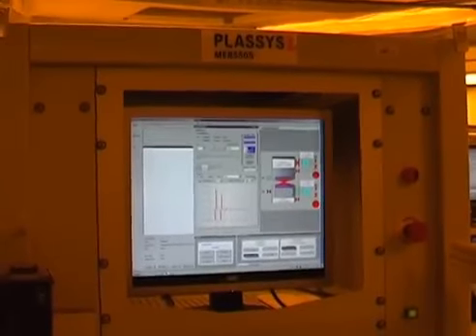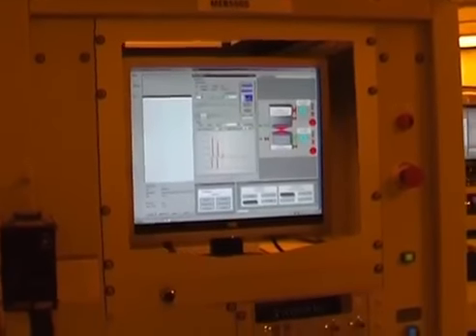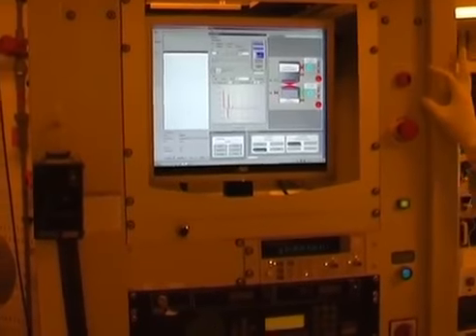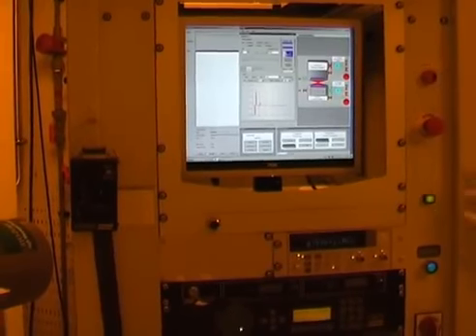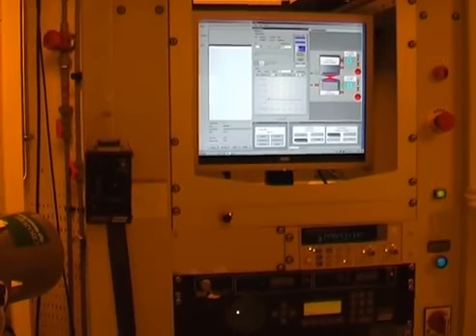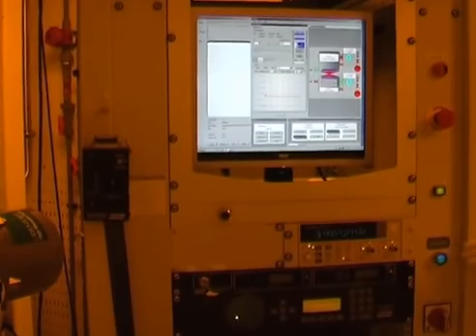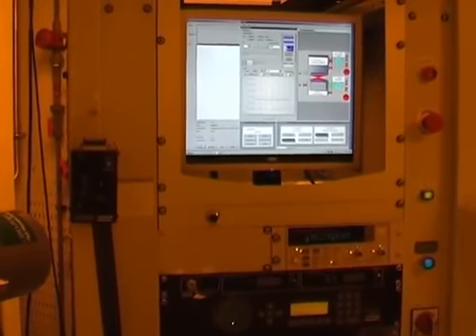While the machine is venting, let's go through the rest of the buttons that we see here. As I said, this one is the emergency stop. This one should light up shortly as the load lock reaches atmosphere. And these ones just indicate that the machine is under proper regime of operation, so that nothing is wrong with the machine.